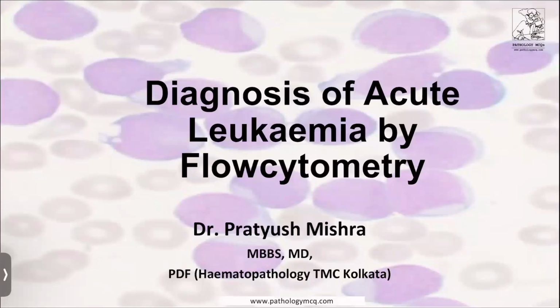I'm a hematopathologist based in Kolkata, and today I'll be taking you all through the diagnosis of acute leukemia by flow cytometry. So we're going to discuss how we can diagnose a case of acute leukemia on flow cytometry with various approaches and various antibody markers.